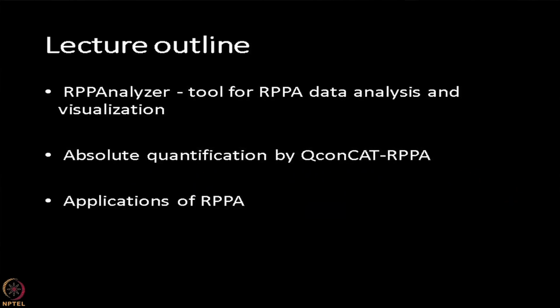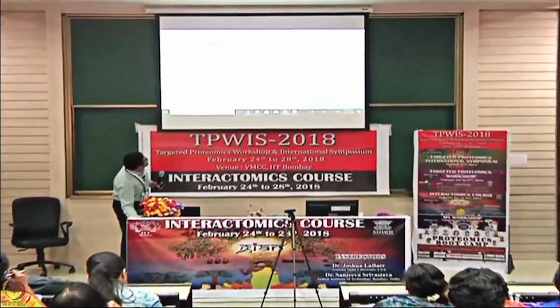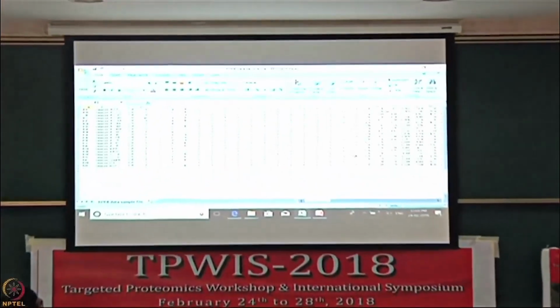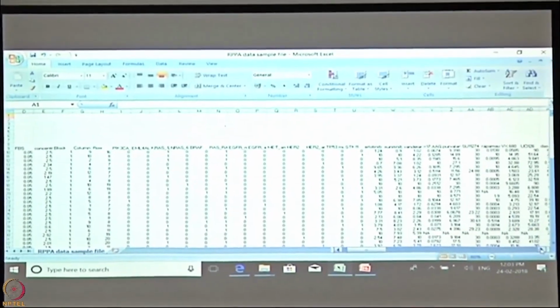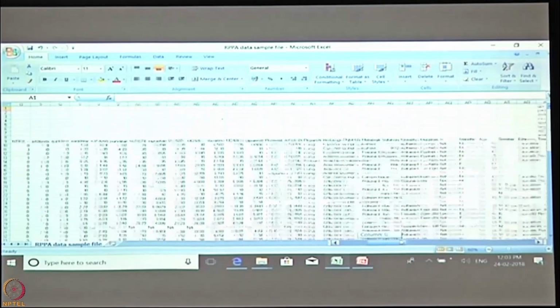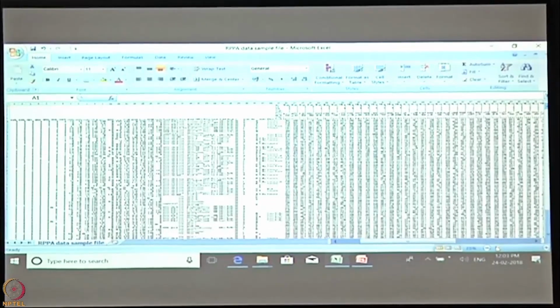I will show you what kind of data we have generated. Here, for example, these are the different samples, these are the different mutations in the cell lines. So, you can see that this is the data we could generate. And drug resistance can be incorporated here. So, this kind of numbers you will get. These are the target names. So, your complex matrix will be like this.